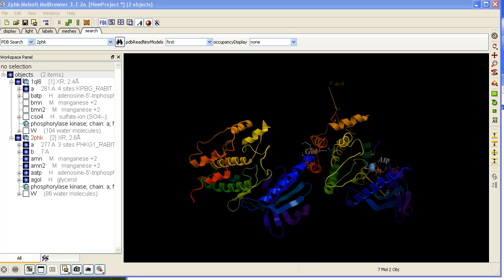How to superimpose. In this example we have two kinases loaded into ICM, one called 1QL6 and the other 2PHK.